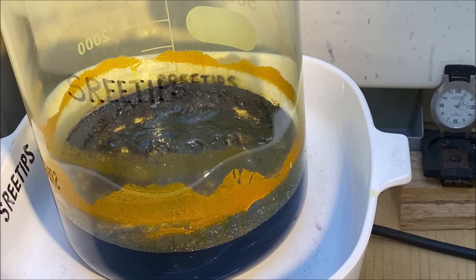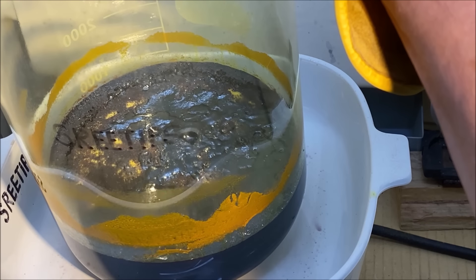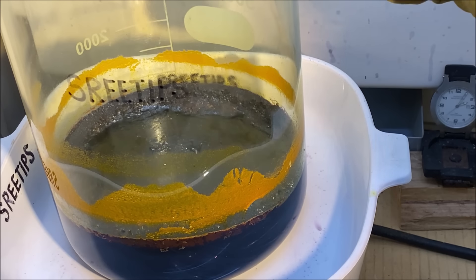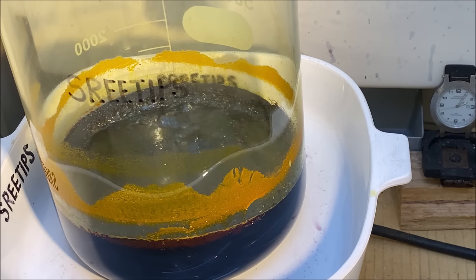Very close to being complete here. There's just a little bit of liquid left in there — the whole bottom of the beaker is solid, well, there's still some liquid I guess. We're just going to have to continue on until we get the rest of this liquid to form a solid chunk.